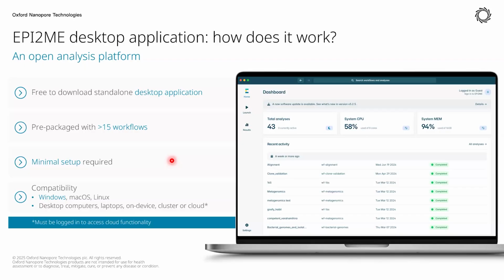They all have what I usually consider to be sane default settings. So they'll work with most samples, but it's always good to familiarize yourself with all of those different options and parameters so that you run the analysis in a way that best captures the data of your sample. The workflows and graphical interface are all compatible across different operating systems, so you can run these on Windows, macOS, or Linux. You can run it on your desktop, your laptop, workstation, an HPC, or on an AWS instance in the cloud, or really anywhere you want to run it.